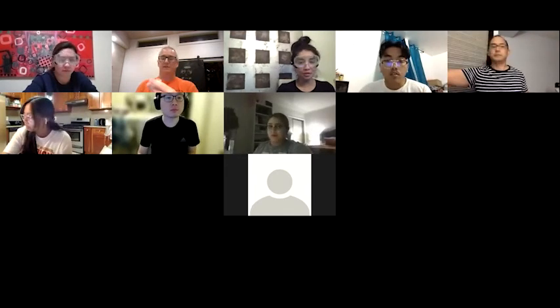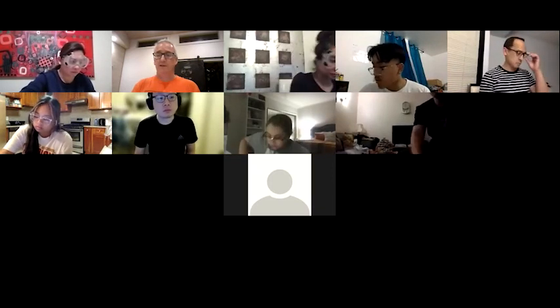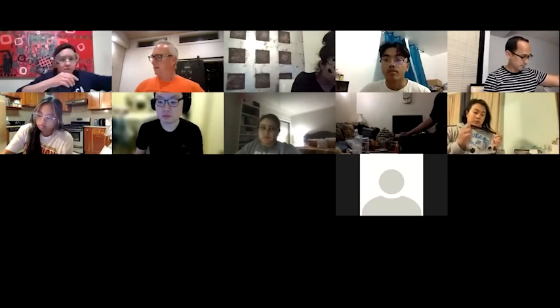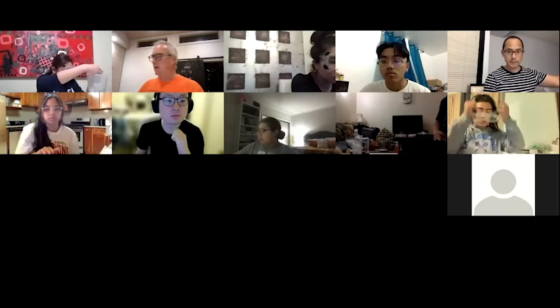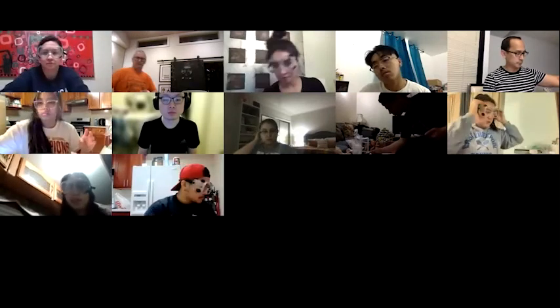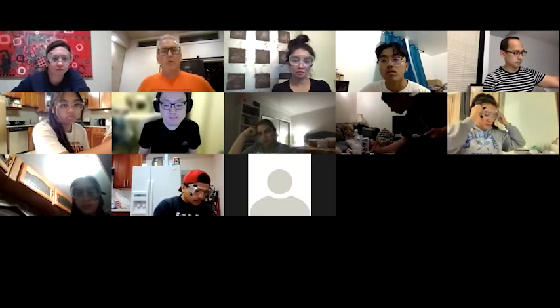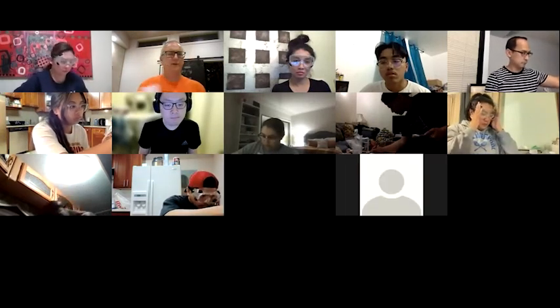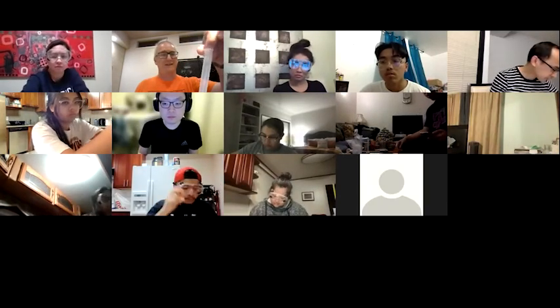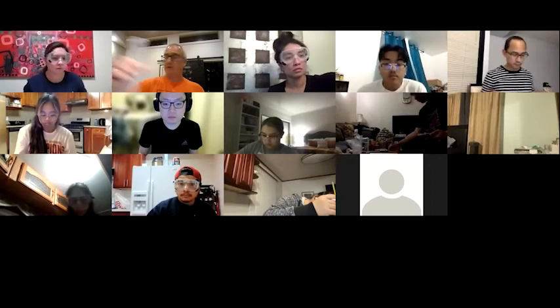All right, so yeah, so just to make sure you get the temperature of the water. That's going to be really important. And then make a note of what your high and low intervals are going to be. So it's going to be fairly easy for the 10 mil because it says right on it what the intervals are. And same with the 50 mil. It says what they are.